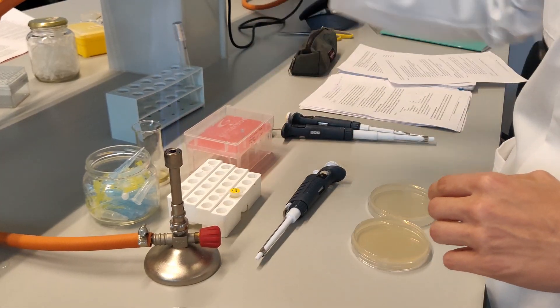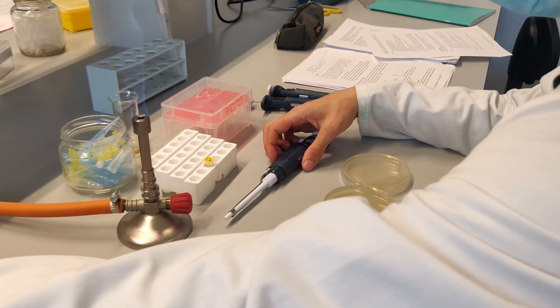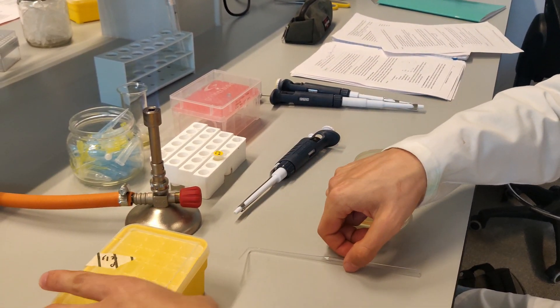Plate 100 microliters out on LB plates with selection markers so only these colonies will grow on the plates.